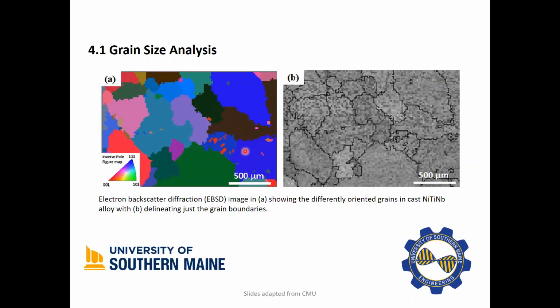It's basically showing that the different colors have different orientations over here, and then over here you have the software which is delineating the grain boundaries.